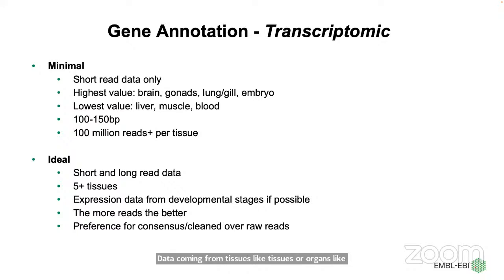The minimum length of these short reads which is expected is around 100 to 150 base pairs, and we expect at least 100 million reads per tissue.